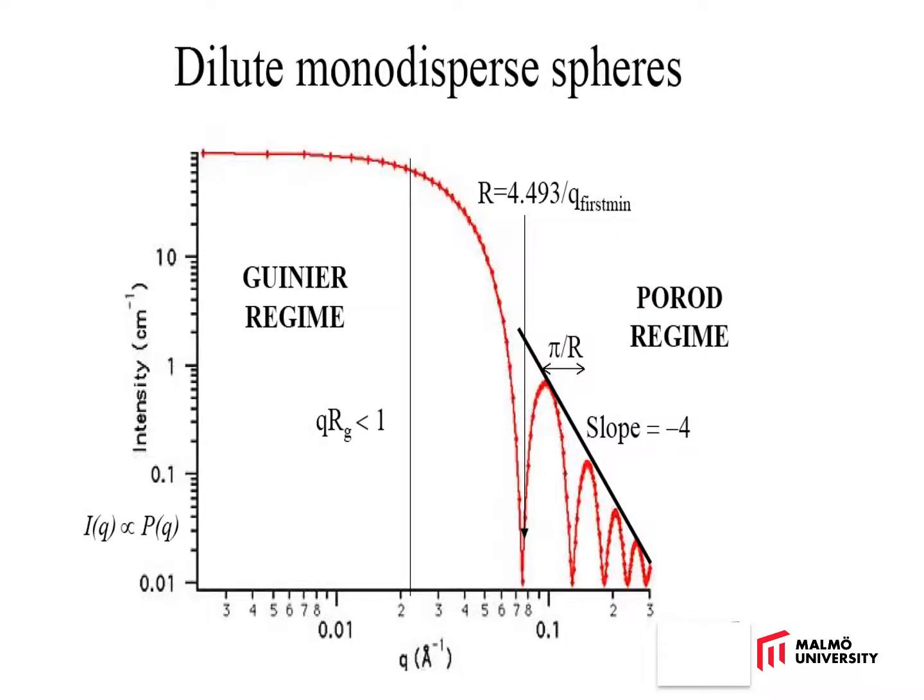So here's an example of some modeling calculations from a sphere, and I've superimposed the limiting laws on there as well, so you can see the same information is there. But I guess what it does do is allow you to integrate all this information into the one curve.